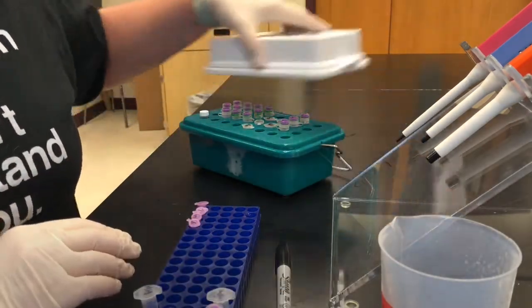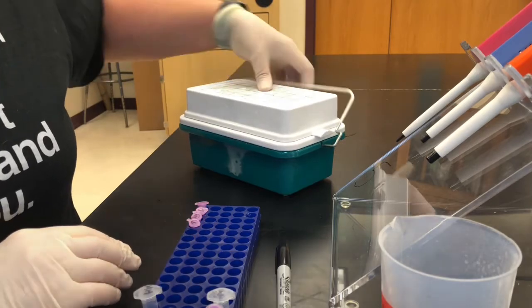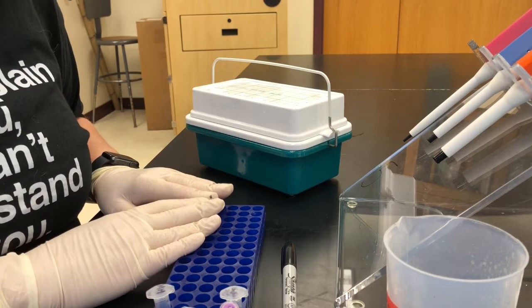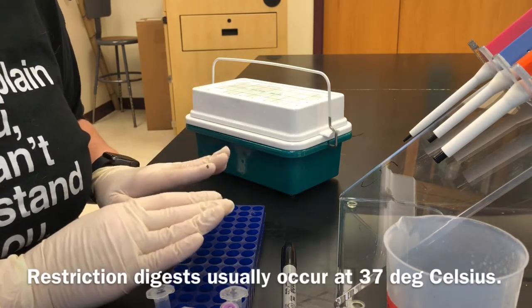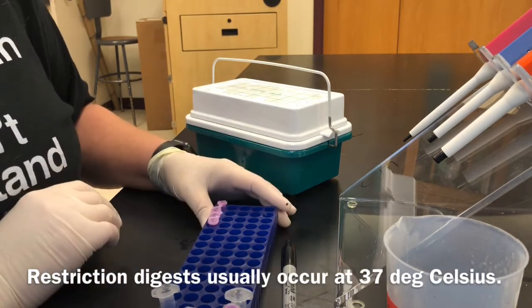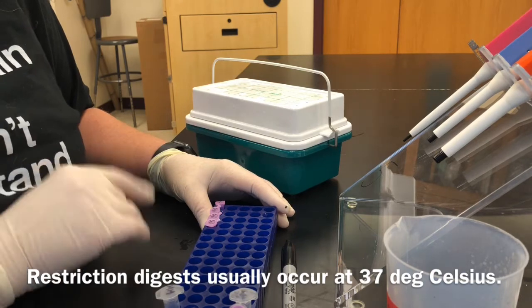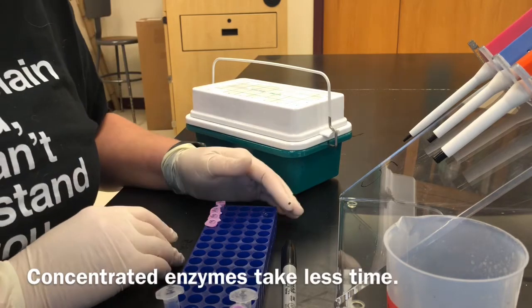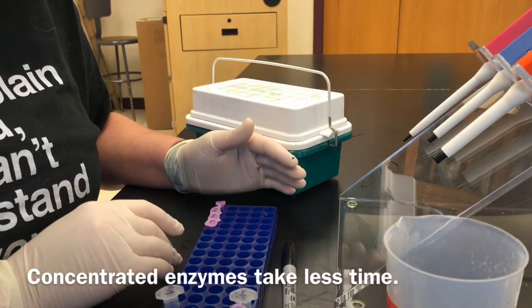These samples are ready to go into the water bath at 37 degrees Celsius for about half an hour for the digestion to complete. Once that's done, we'll be able to set up our gel for running the RFLP results.